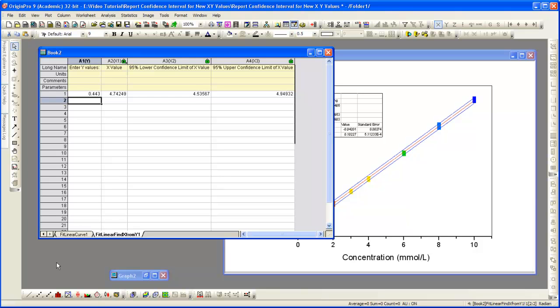When we hit Enter, Origin calculates the corresponding concentration and confidence interval.